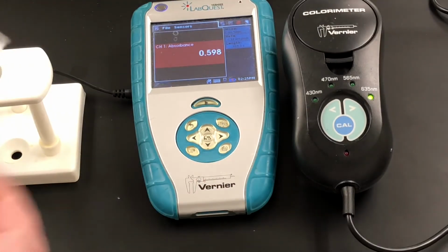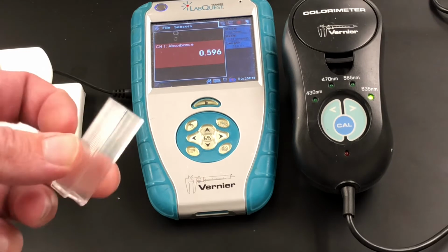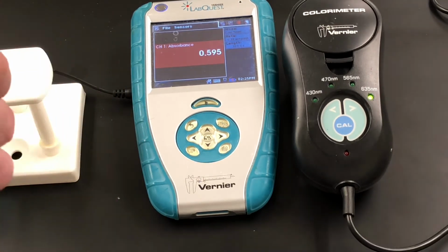So you always want to handle it from the sides that are fluted like this, which give a fogginess, and we always keep a nice clear front and back. So I'm just going to wipe this off and get it nice and clear.